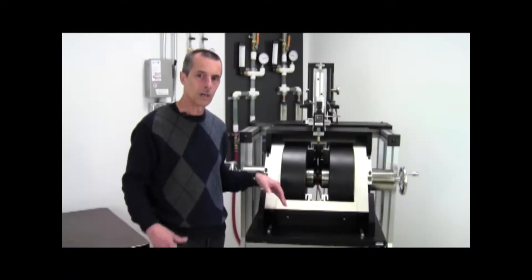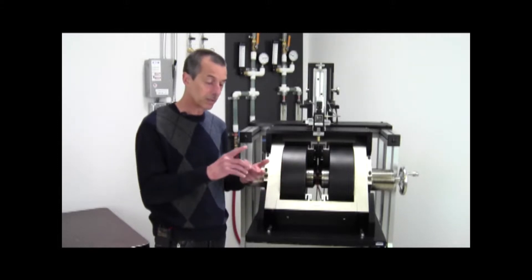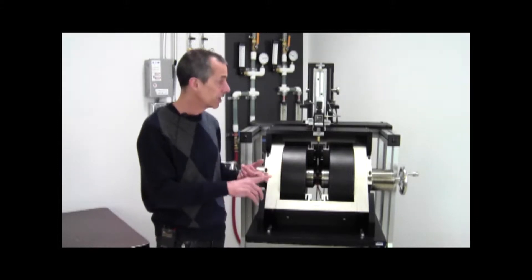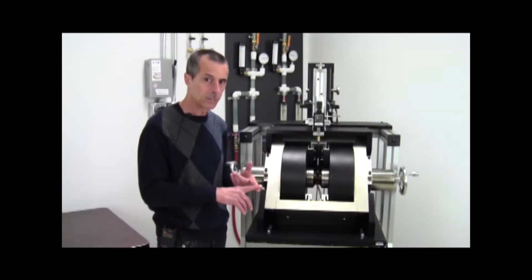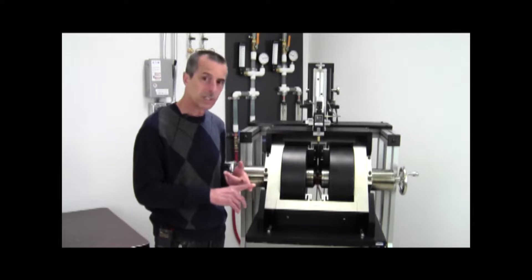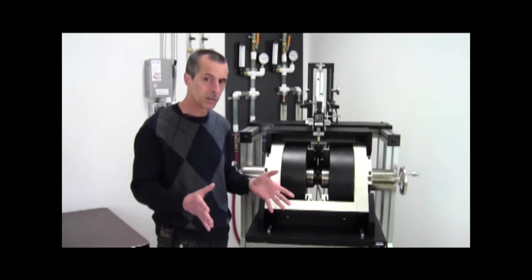A couple of very unique features about the Micromag Magnetometers are sensitivity and measurement speed. The VSM sensitivity or noise floor is about 0.1 micro-EMU. The AGM sensitivity is better than 10 nano-EMU, so it's a very, very sensitive magnetometry technique.